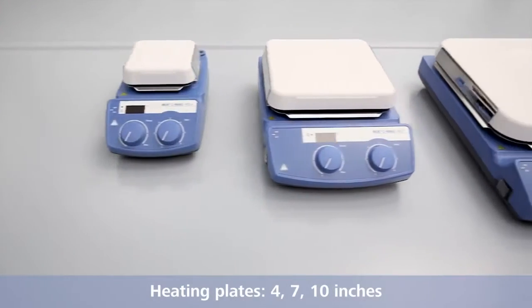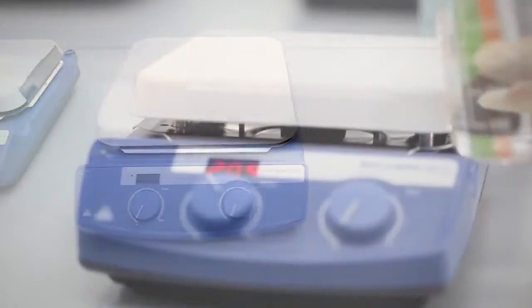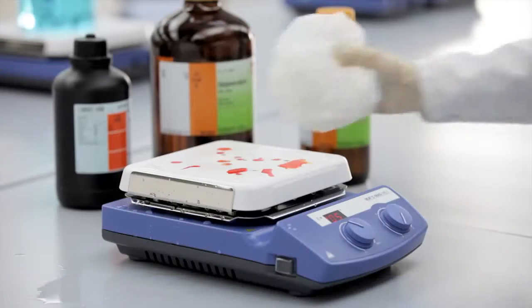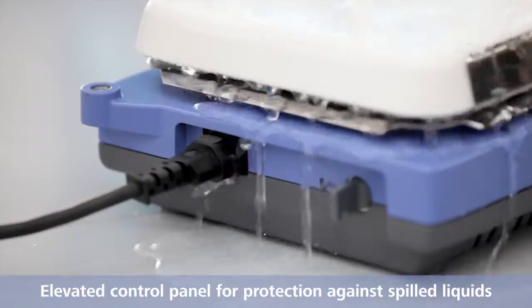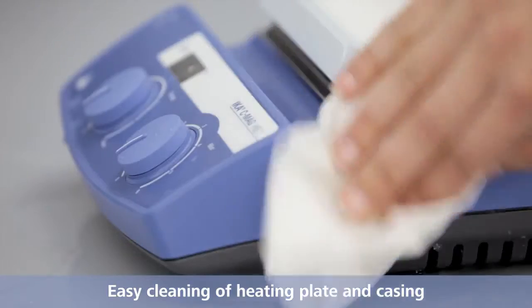All devices are available with heating plates of 4, 7, and 10 inches. The ceramic heating plate offers excellent chemical resistance. The elevated control panel protects the display from spilled liquids. Easy cleaning of heating plate and device casing.